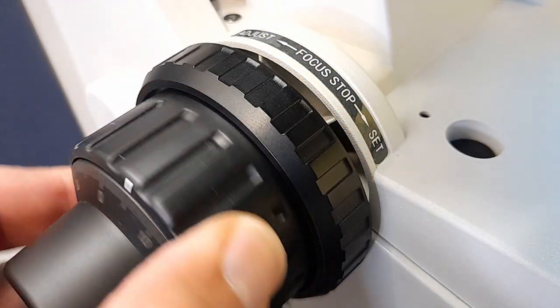On the left side and next to the coarse focus knob you have the so-called focus lock and this focus lock allows you to adjust the highest position of the stage. It's very nice to have this feature as well, especially if you do oil immersion photography because it allows you for a very quick way to exchange the slides. So you basically focus everything using oil immersion. Then you engage the focus lock and then you're able to lower the slide and the stage and you're able to exchange it and it is not necessary to go through the complete focusing process again.